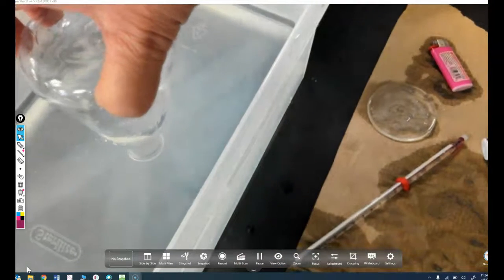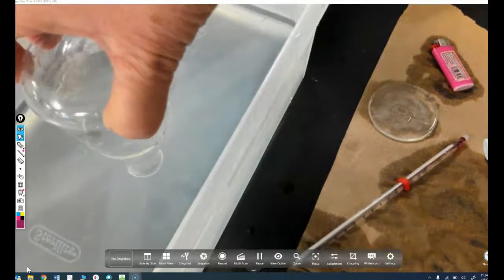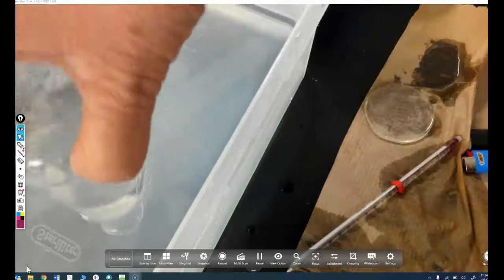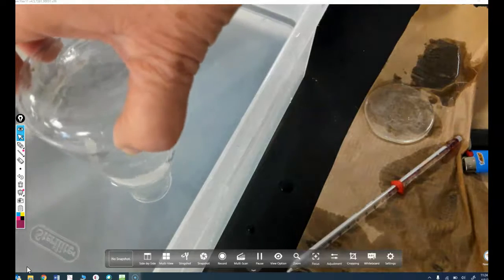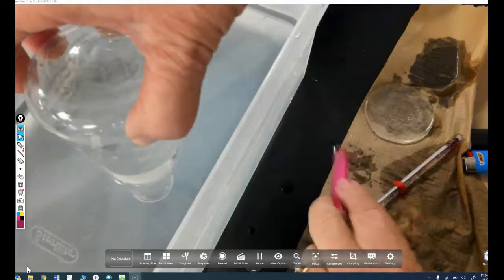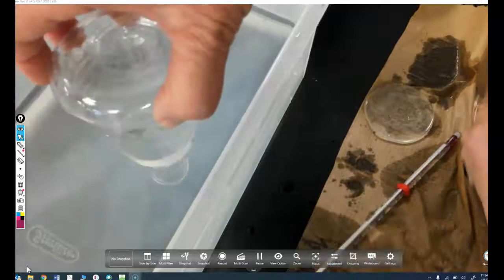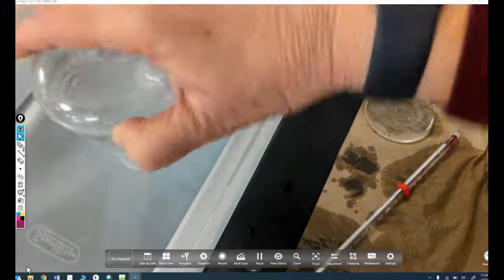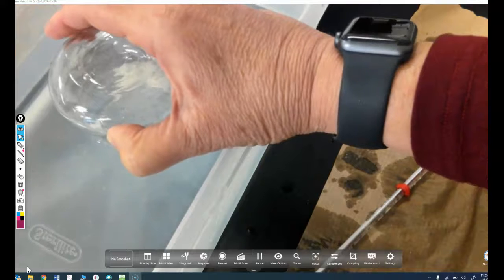And then it says, remove the lighter, dry it with a paper towel. So that's what I'm doing here, I am drying the lighter with a paper towel. And so there is my lighter that we're going to have to shake to get all the water out of. Yes, I need to get all the water out of it. And I'll keep doing that. Set it aside for step 10.